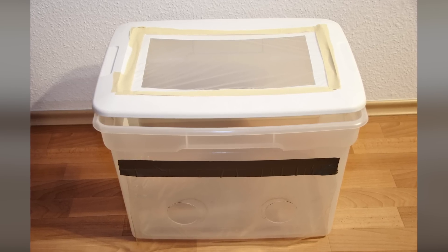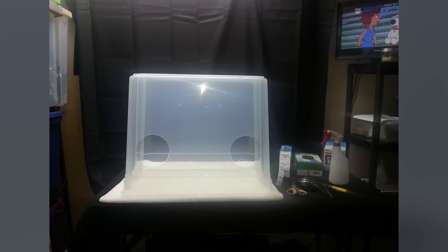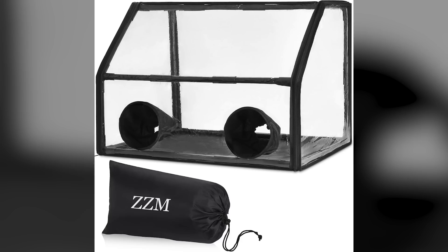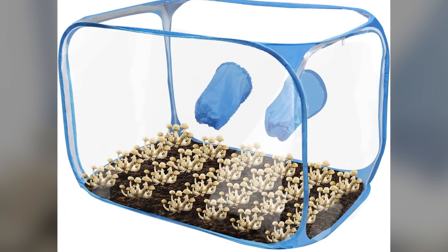Back when I started growing mushrooms, there were only DIY versions of a still air box available on the Shroomery or other forums. Today there's a bunch of products flooding the markets on Amazon and other consumer outlets that are designed for growing mushrooms. So how do you know if it's a good product or not?